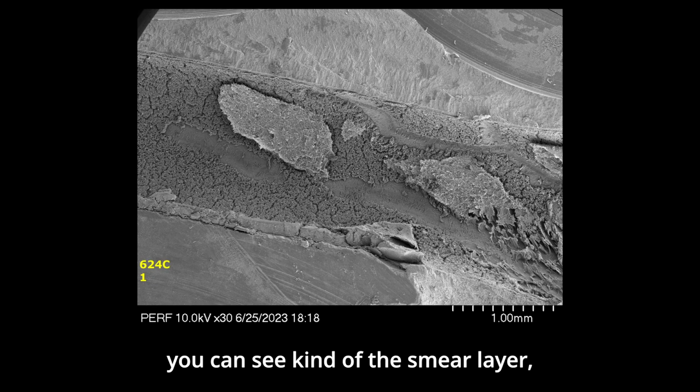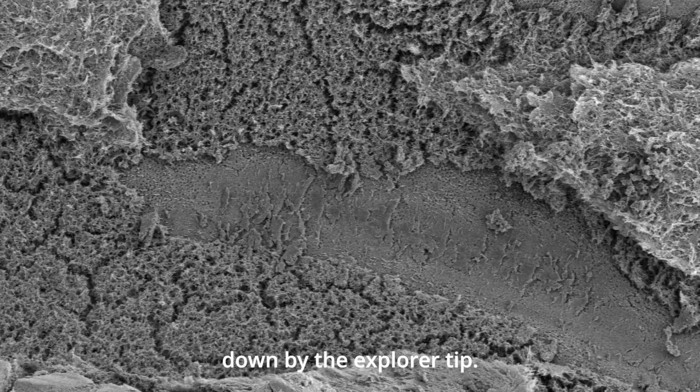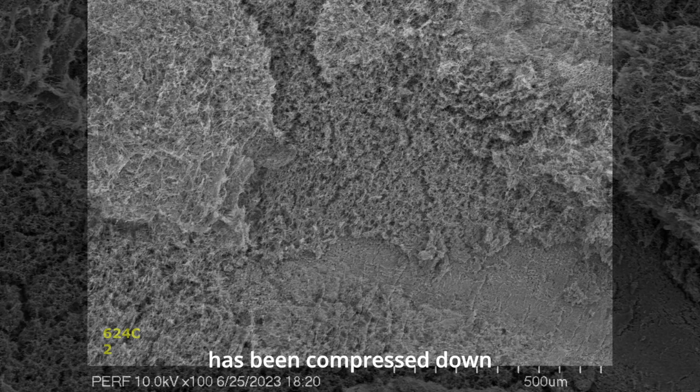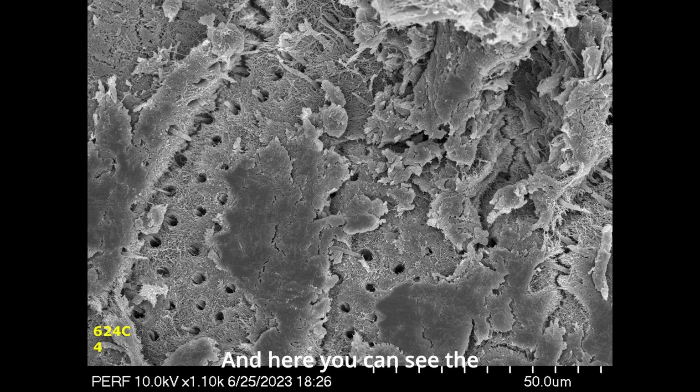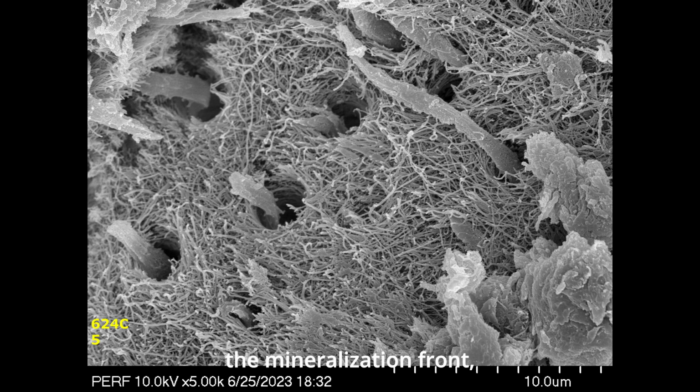And when you actually go into this area, you can see the smear layer, which is actually the predentin that's been compressed down by the Explorer tip. So this gives you a sense of how to look at these structures and understand how the processing affects what you're actually seeing. Now, the predentin has been compressed down onto the mineralization front. And here you can see the collagen of the predentin. This is right above the mineralization front, as well as the Tomes processes that are going down into the tubule.